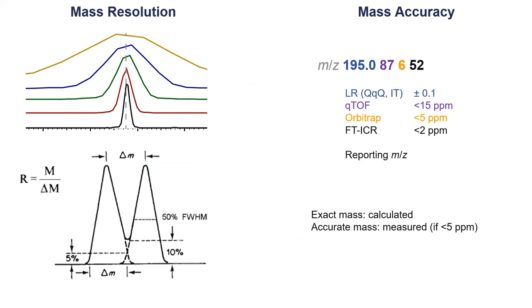So maybe you can say like 1 digit. If you have done a Q-TOF, where the resolution is already a bit higher, you can add like 2 digits more. With Orbitrap, again more. And if you go to FTICR, for example, you can add even more. But this is something you need to be aware of. Even if the system says 5 digits and it's a triple quadrupole, maybe check it and see if this is actually true, and then just use fewer digits in the answer. Okay.